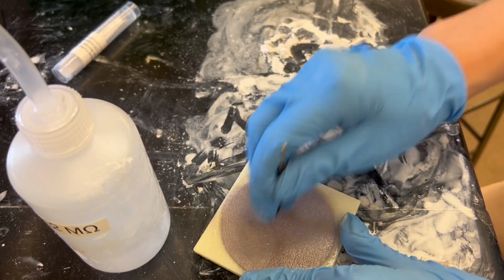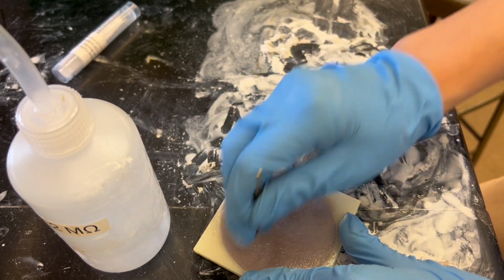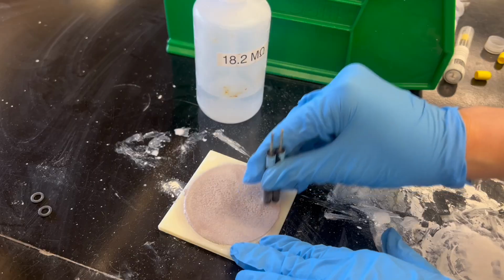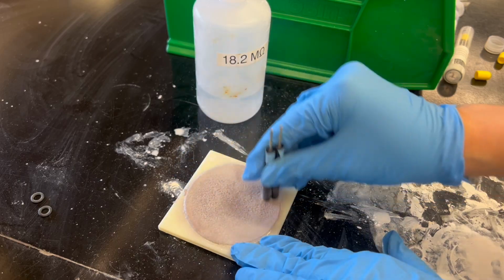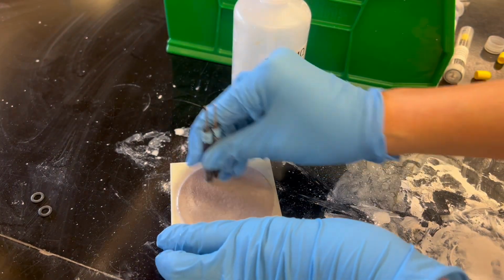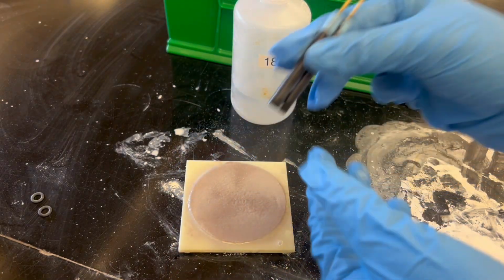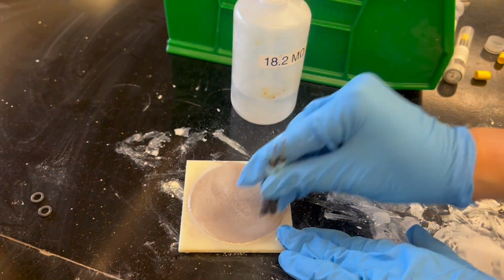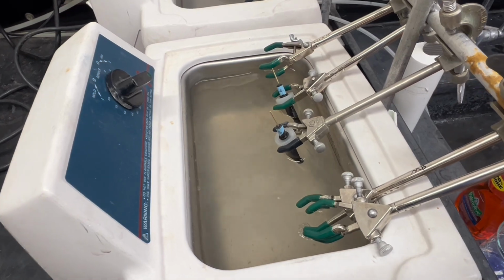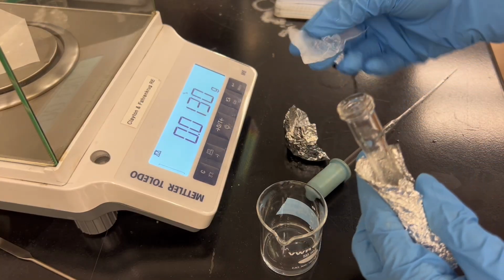When polishing the electrode, moving it in a figure 8 motion could help us polish it very efficiently. If you feel very consistent resistance, then we could add some water. We grind each electrode for 5 minutes. When the timer is up, we take it to rinse with pure water and sonicate with pure water for about 20 minutes.